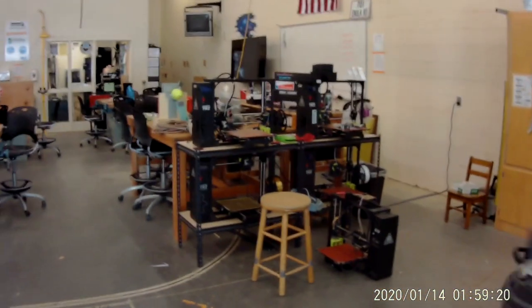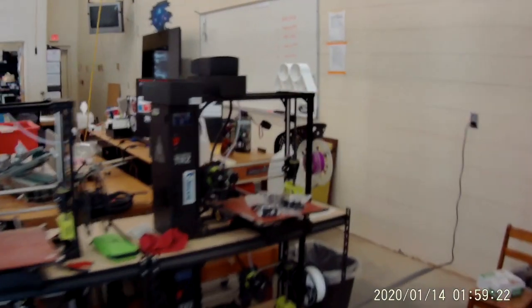Work areas should be kept clean and tidy. Students should always clean and wipe dry all desks, tables, or laboratory work areas at the conclusion of each laboratory activity. Never handle broken glass.